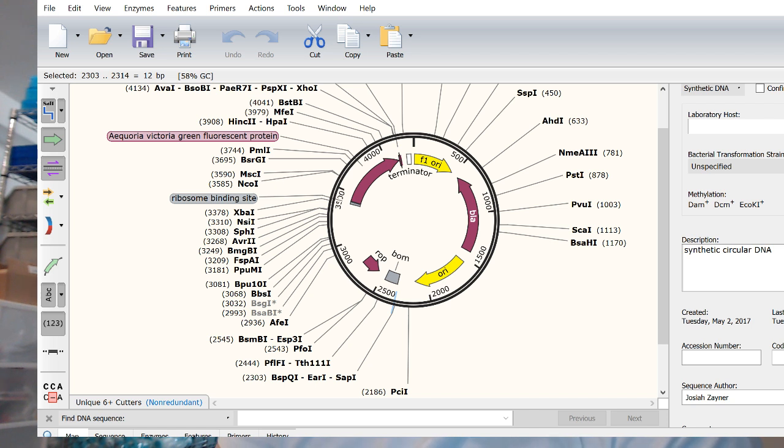So, in the class for this week, you should have an experiment of taking this Pro-K1 EGFP plasmid and sticking it inside bacteria, right? So that should be part of your experiment for this week.